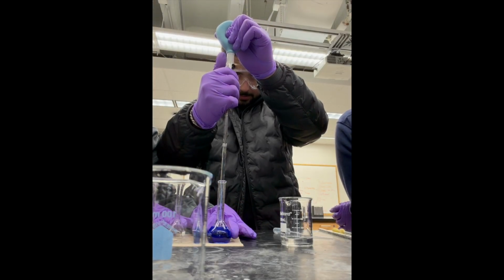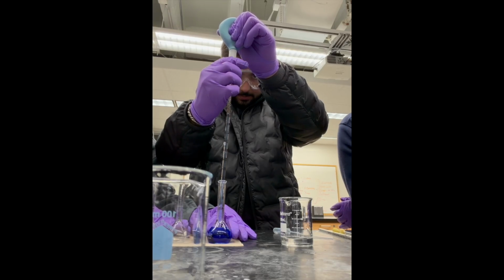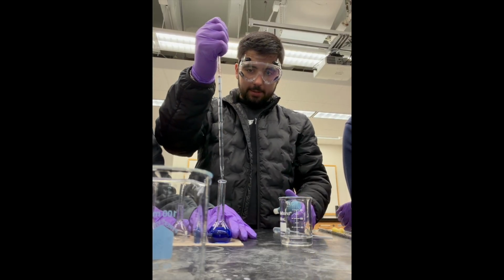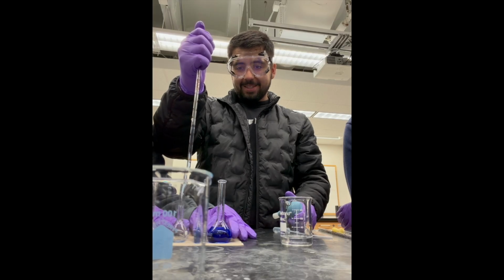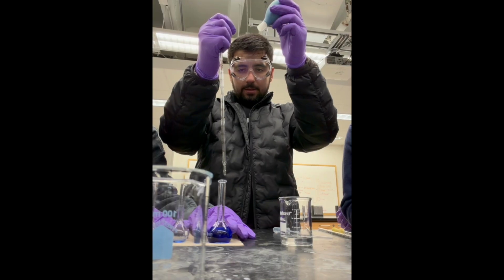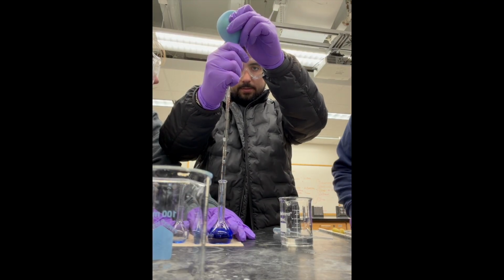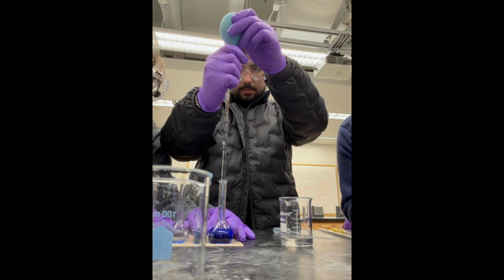In this first clip, you'll see me transferring 5 milliliters of our stock solution, which I've put in a volumetric flask. I'm transferring this over into an empty volumetric flask, which has a total volume of 25 milliliters. We are using 5 milliliters consistently from either our previous dilution, or in this case the stock solution, as it's our first dilution, in order to have consistency between our dilutions.